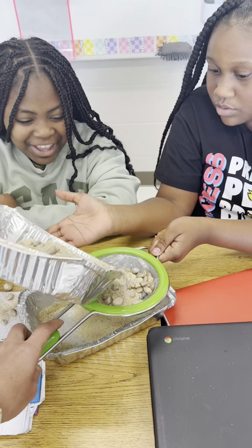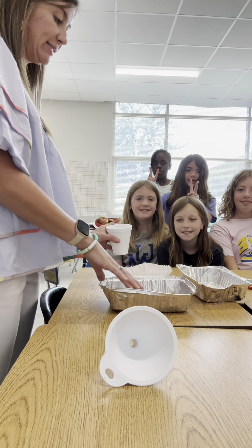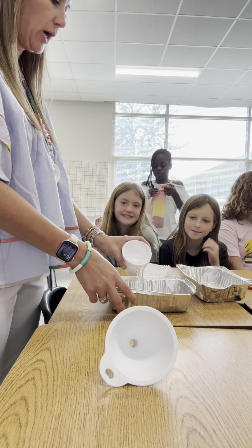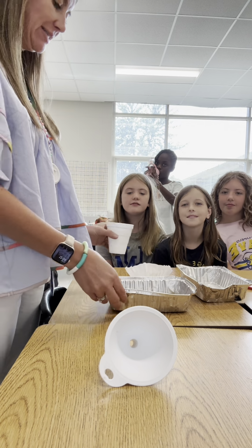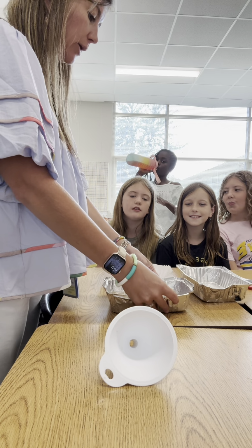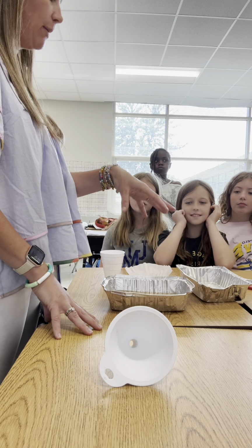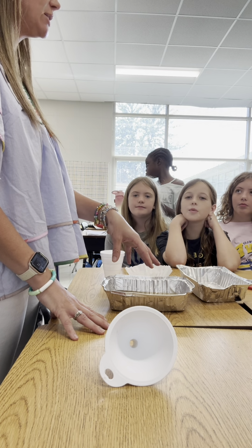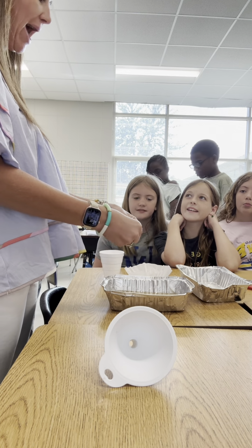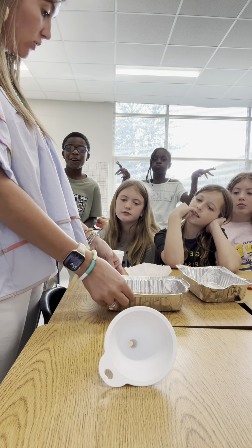Taylor, what happened? Okay, so I have my sand by itself. I'm going to add water to my sand. And now I have a sand and water mixture. Is the sand soluble? Does it have the ability to dissolve? No. What happens to the sand and water when I add them? The sand sinks, therefore it has more density than the water because it sinks.